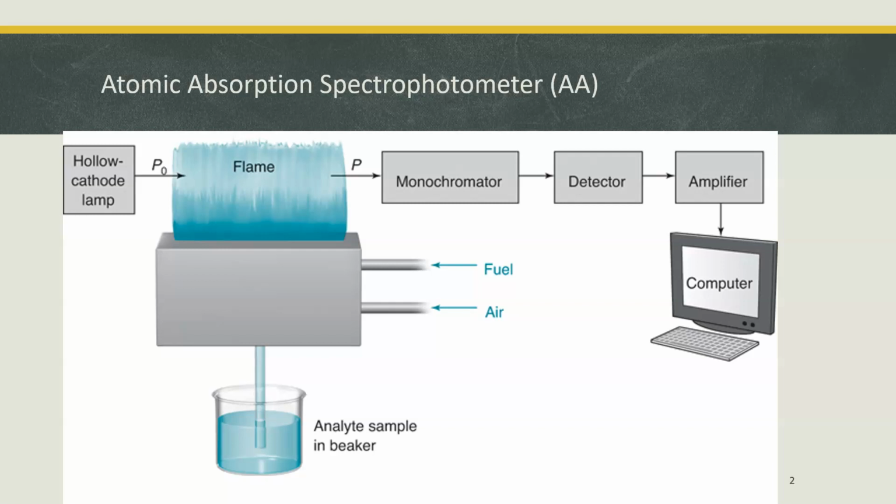Okay. Well, atomic absorption just measures one element. So whether that element is in a compound or alone, it measures the amount of that individual element, which are in the atom form, right? So atomic absorption is measuring the absorbance of light by a specific element. And so as a general idea, that's how it's different, okay?